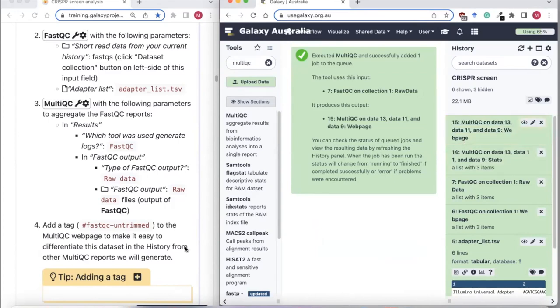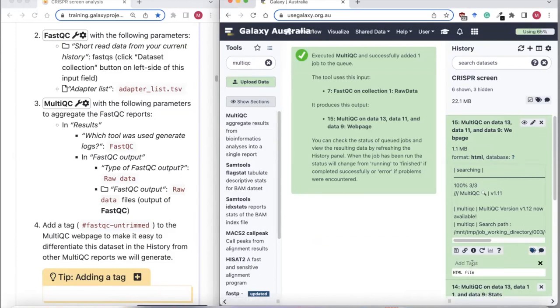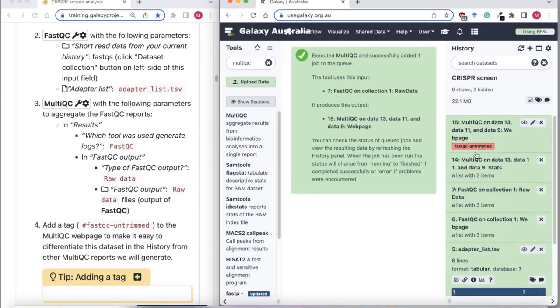This will give us a web page summarizing the FastQC results for our three samples. I'm going to add a tag to make it easier to see what this is in the history — I'll call it FastQC on trim. That makes it easier to know in the history what MultiQC is summarizing.